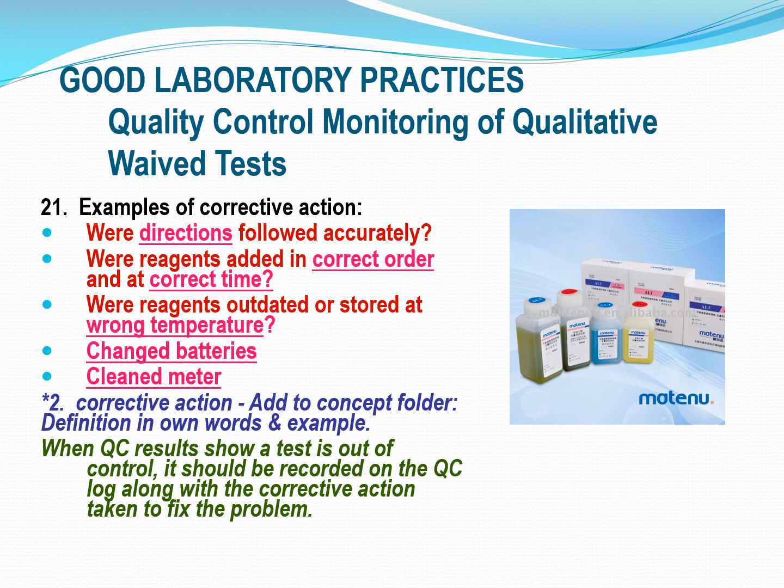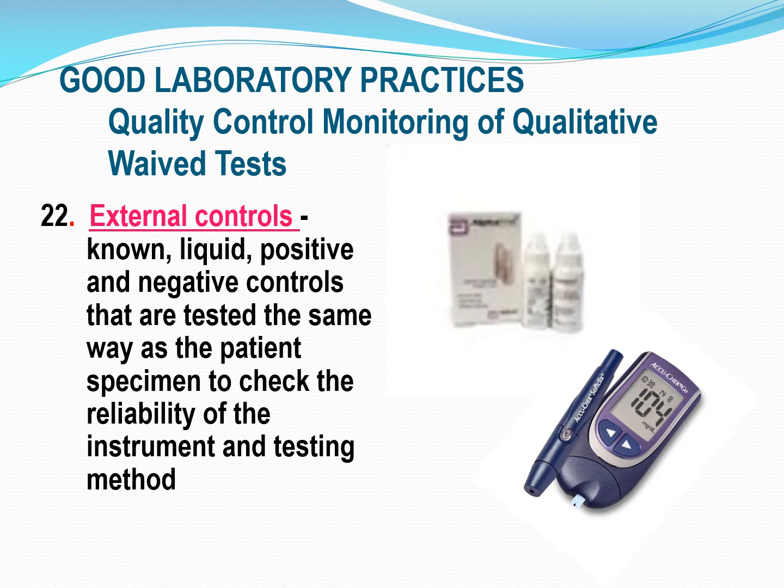Sometimes it comes out of range. This was the problem and you took care of it. They would rather see that than see somebody that claims they have never, ever had a QC out on any instrument they have. That's going to be a red flag to them that something there may not be right.